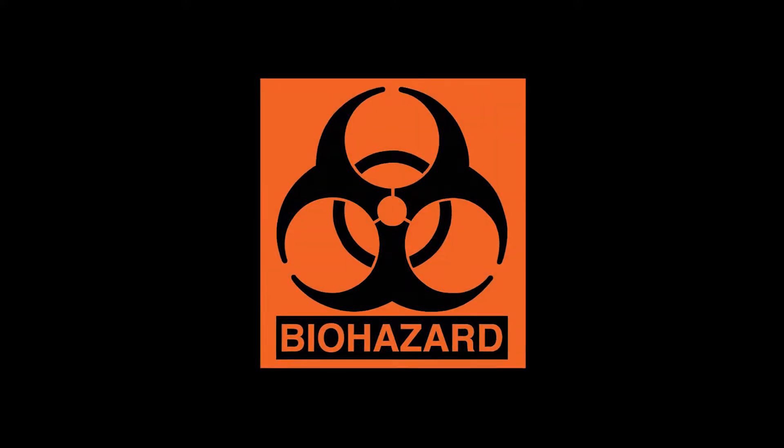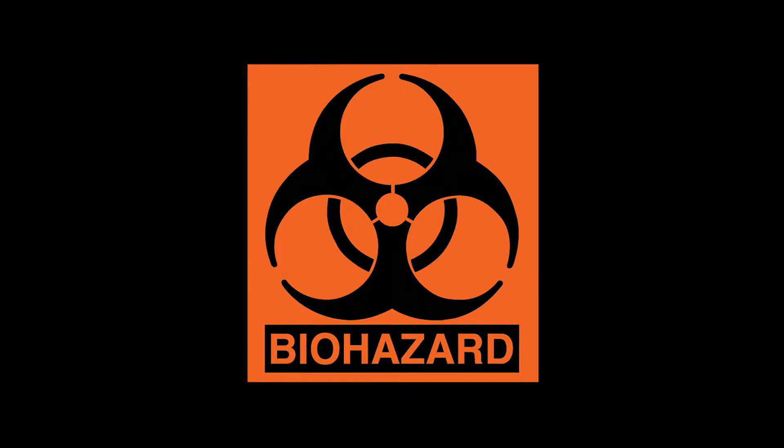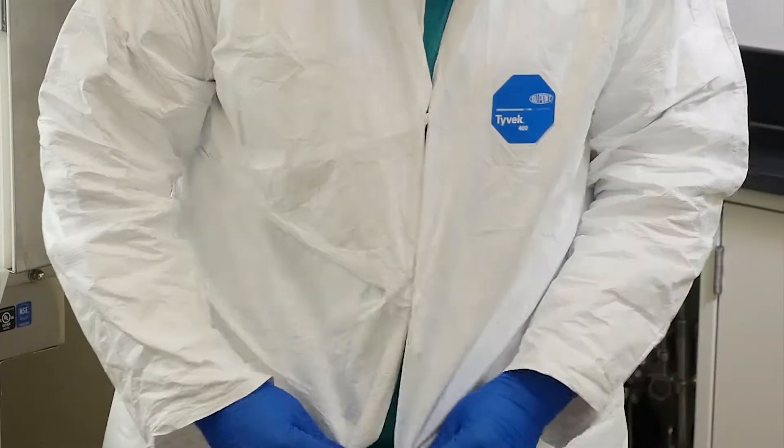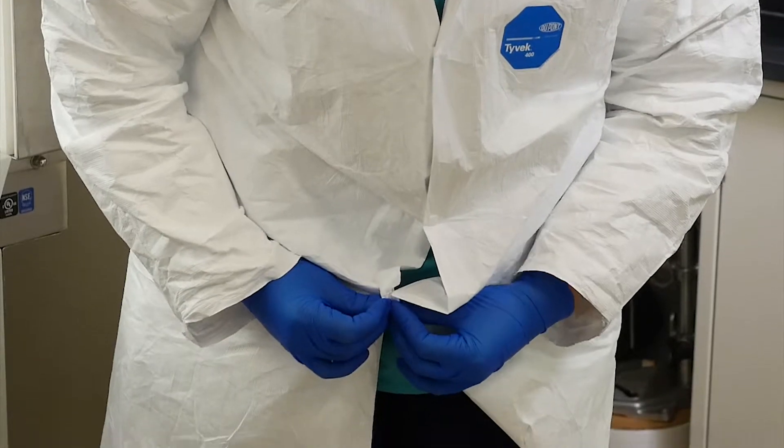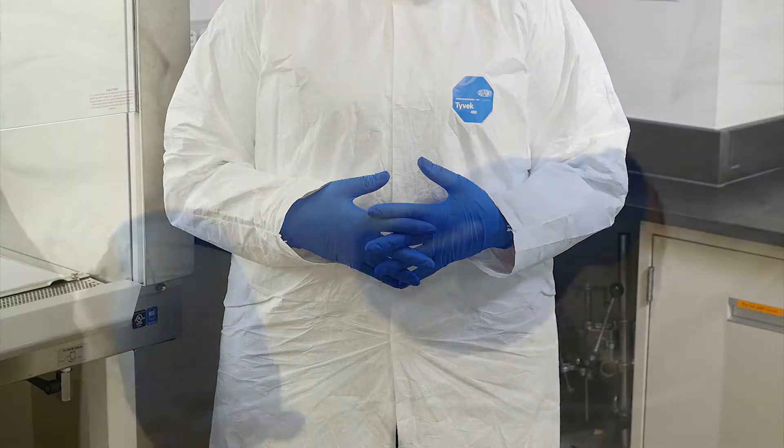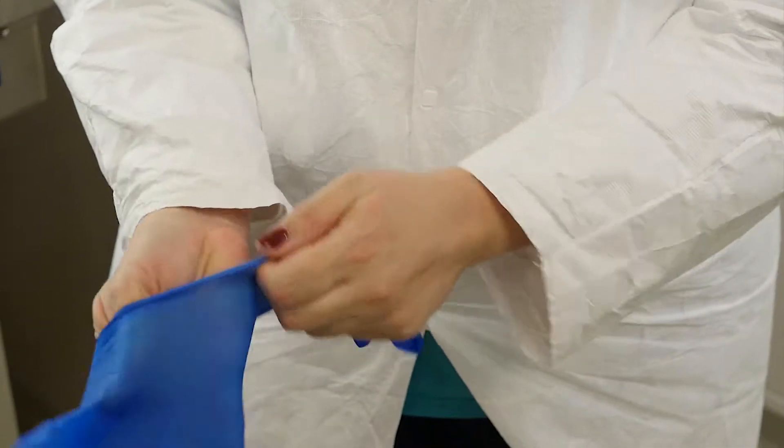Before we start, it is important to remember that working with wastewater or potentially infectious materials presents a safety hazard. Technicians should be trained in biosafety practices. Please use personal protective equipment at all times, including a lab coat and gloves. If the sample contacts your gloves or lab coat, change them immediately.